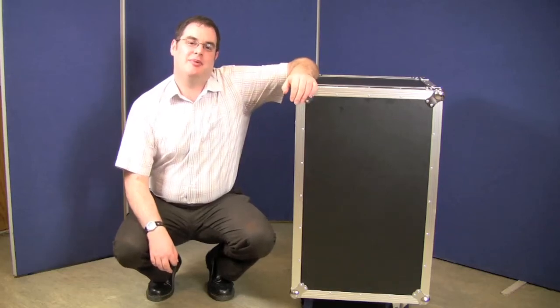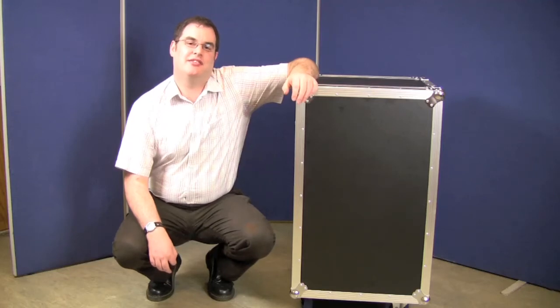This is a quick demonstration of the PSA 10.680 portable online mercury CEM and stat gas analyzer.